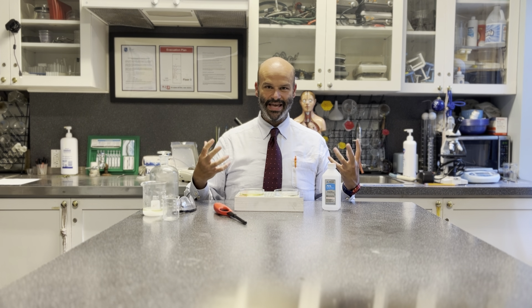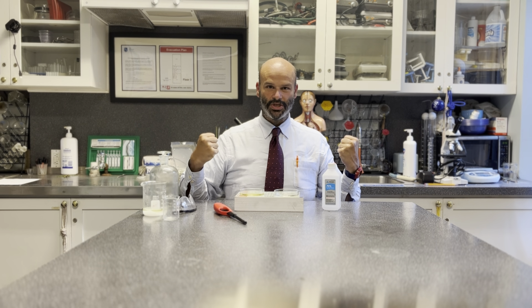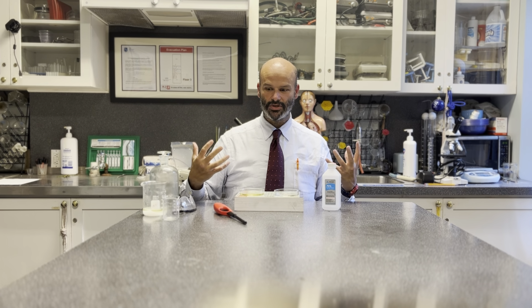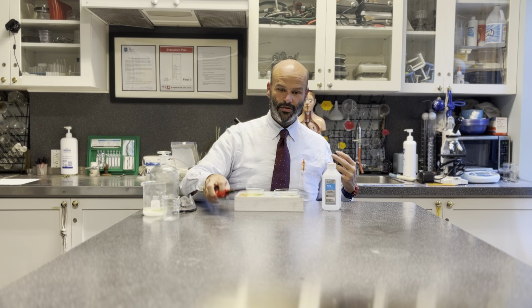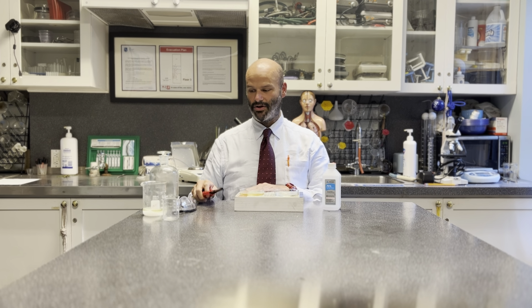Chemistry fundamentally began with the understanding of fire. The first chemists were cooks, and we need to understand fire if we really want to understand heat, if we really want to understand the world that we built. We couldn't have built it without fire, so we need to really understand it. All right, so we've got 70% alcohol here and 95% alcohol here.